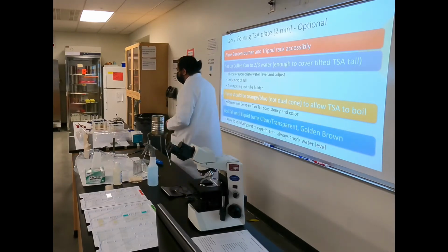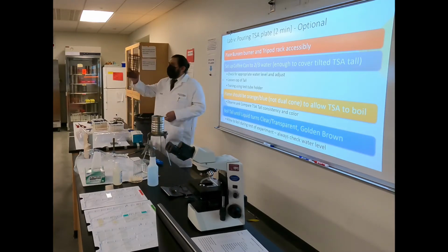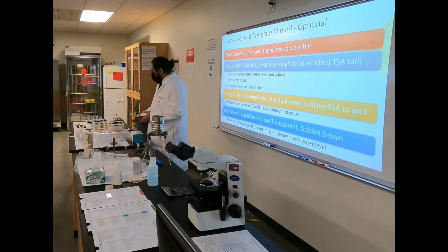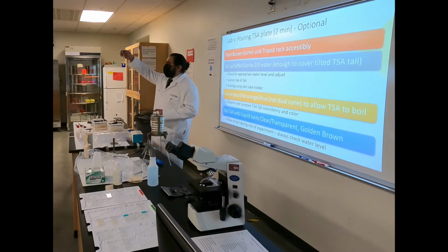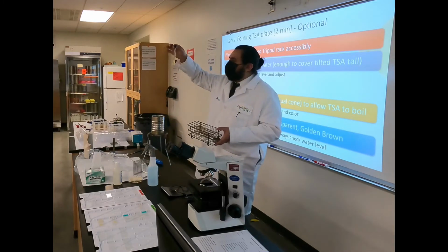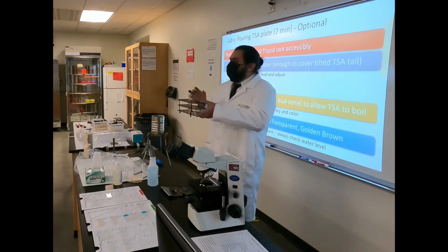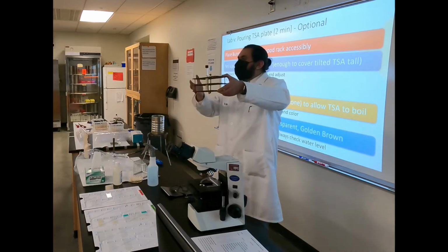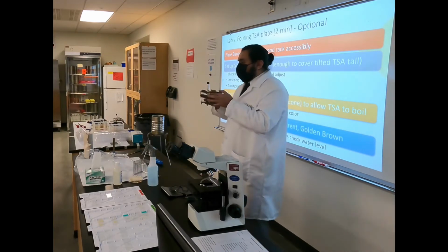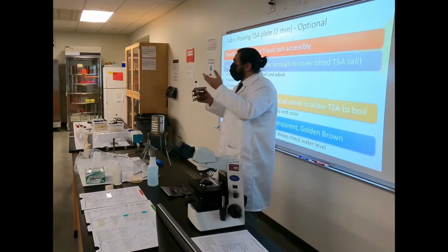And in a second, everybody's going to come and get their wire rack that you should have in front of you. And you're going to come and collect one of these guys. This is a tall. Now the reason why they're called talls is because they're usually a little bit bigger, about 50% bigger than an average tube. You're going to put it in your rack and take it back to your bench. You always want to transport these for safety, right? Especially because they're going to be hot, they're going to be wet, bad ideas.